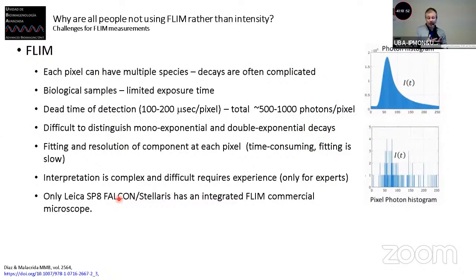Okay, why not all the people are doing lifetime? Well, the truth is, doing lifetime and analyzing lifetime is a challenge. And the reason why it's a challenge is because, contrary to our idyllic view of the decay, in a pixel you have very few photons because you collect for a very small amount of time. And this really small amount of time enables you to collect a certain amount of photons, hundreds, but not millions. When you have to fit something with only hundreds of photons, well, you will start to struggle. You will start having problems.